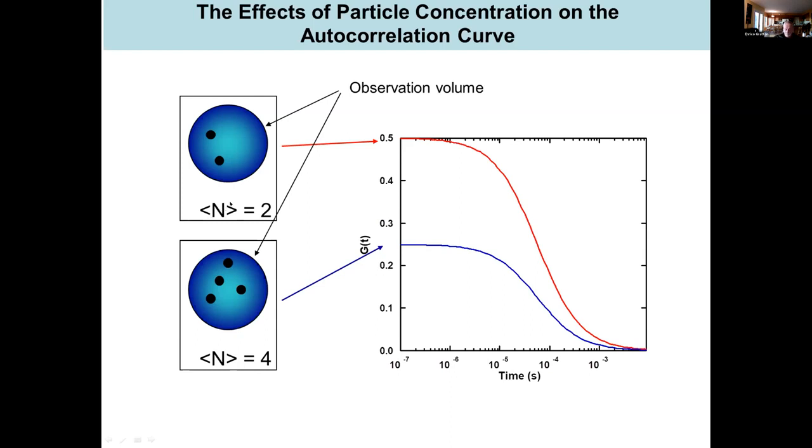This is very important because, for example, I can place my volume of excitation in the nucleus and measure the concentration of a protein, or I can put it in the cytoplasm or in the mitochondria, and I can measure the number of molecules I have in those parts of the cell. And this is independent of the instrument, if I measure the fluctuation, because that value depends only on the molecules leaving and coming in. And that is very important because that means that an experiment done in my lab or in any other lab in Montevideo or Buenos Aires will give exactly the same value.